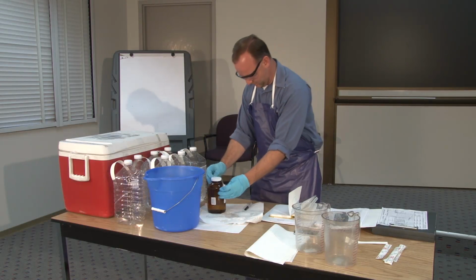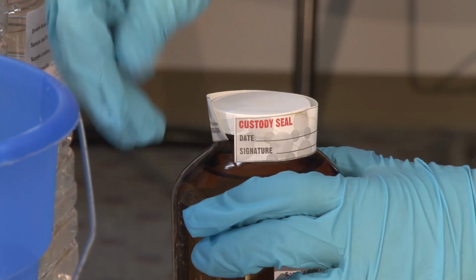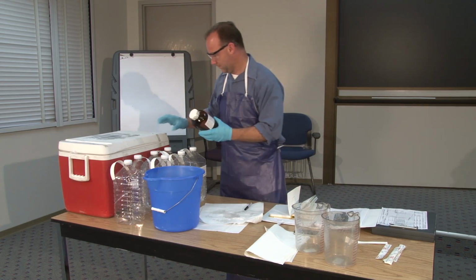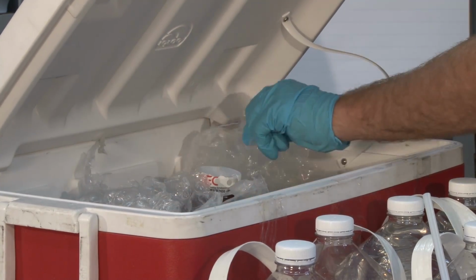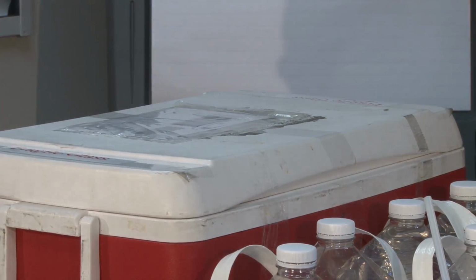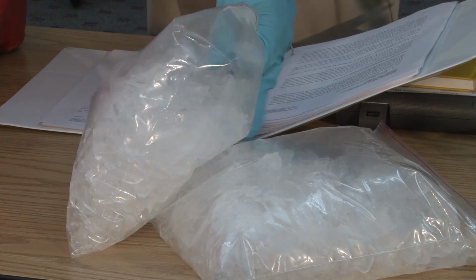Seal all sample containers by wrapping a piece of clear wide tape around the top to prevent the lid from popping off or unscrewing. When they are properly protected, carefully pack the sample containers into the cooler. To preserve the water samples and ensure the physical and chemical integrity during transport and storage, cool all samples to a temperature of 6 degrees centigrade or less using ice.